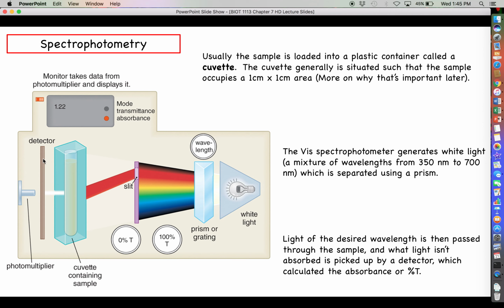at 595. So for this reason, when we did the Bradford assay, we set the spectrophotometer to measure only at 595 nanometers, not only because that is the wavelength at which the Coomassie absorbs light the best, but because it's likelier that we're going to avoid hitting any absorbance values for other molecules that might be in the solution with the Coomassie.